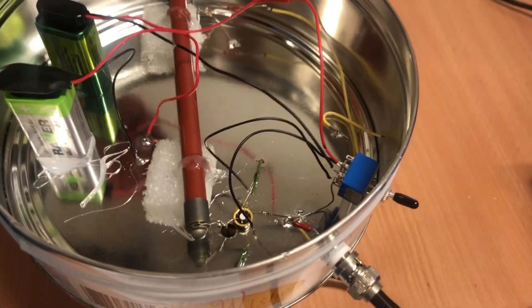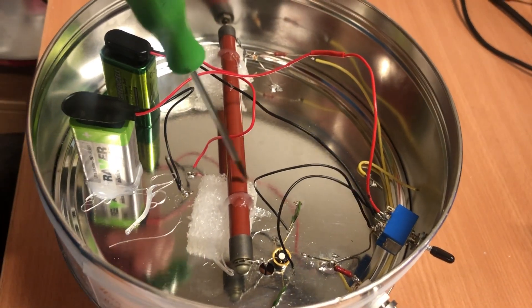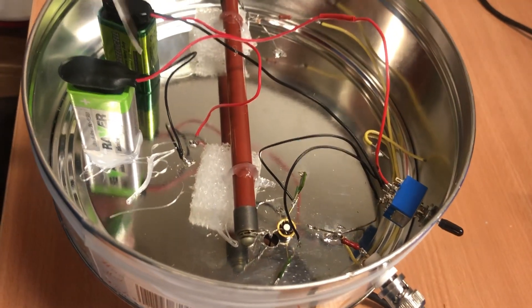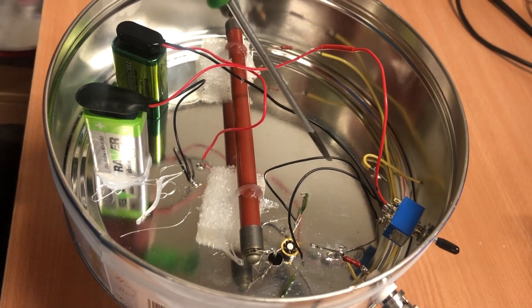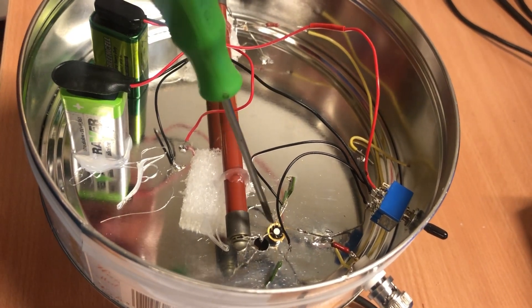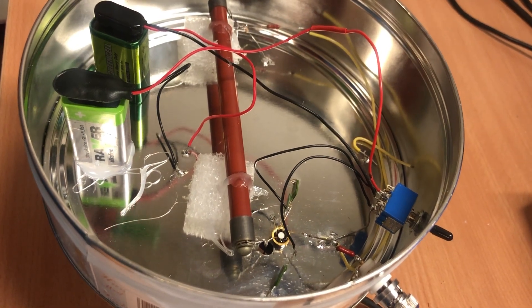In the box we see 3 gigaohm resistor, operational amplifier, two batteries supplying plus and minus voltage. And basically that's it. And here in the hole goes a central electrode.